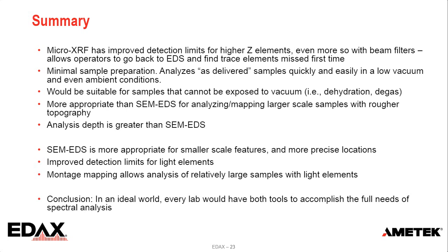SEM-EDS is more appropriate for smaller scale features and more precise locations because it has much better spatial resolution, and it has improved detection limits for light elements.